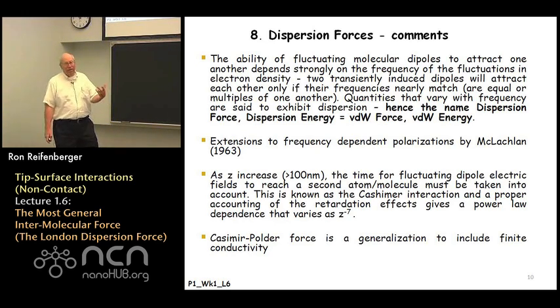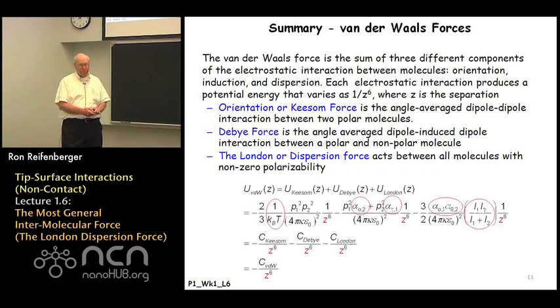Of course, we've always calculated interaction potential energies. To calculate forces, we have to take a derivative with respect to the separation distance, and we have to multiply that derivative by -1. So that's always assumed in this discussion. It's pretty simple to take derivatives. It's much easier to calculate forces by taking a derivative than it is to sum up all the vector forces from the beginning. So that's the reason we focus more on the interaction potential energies rather than the interaction forces, although you can get the interaction forces in a very simple way from the interaction potential energies.